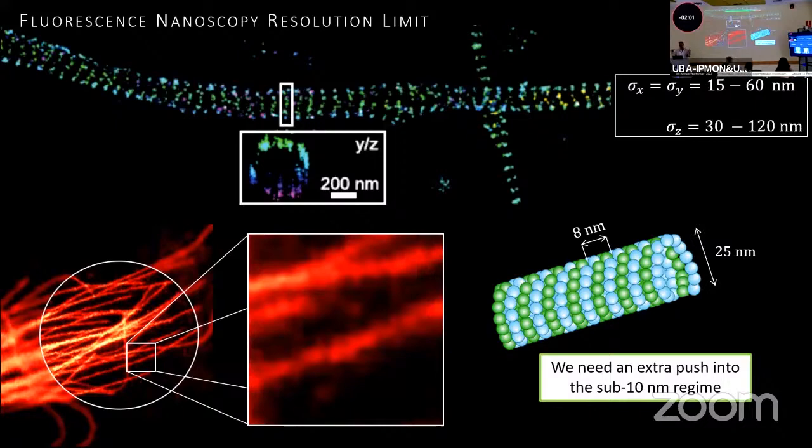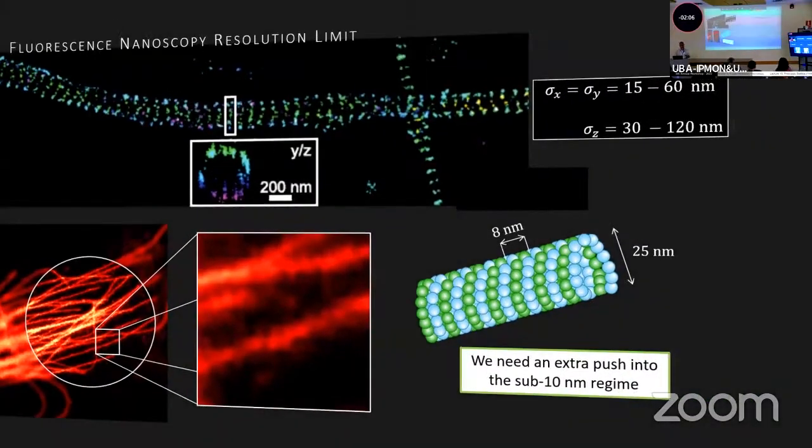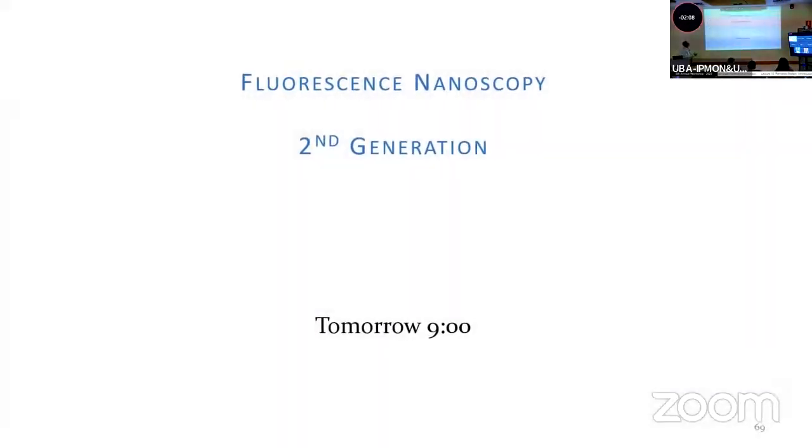Fundamentally, actually, there's no limit, but there is a limit in practice. So that gave rise to what I call a second generation of super resolution methods that can solve that limit. And tomorrow at 9 o'clock is the second chapter, and we will see some of those methods.